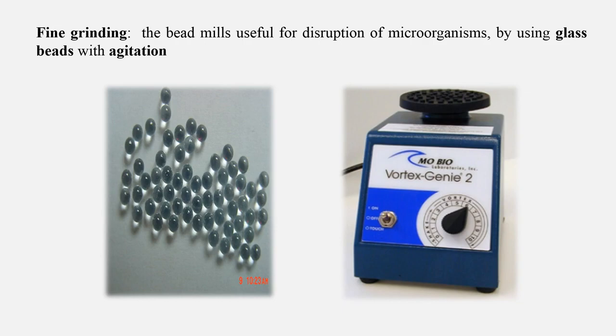هذه الطريقة تؤدي إلى إنتاج أو توليد حرارة بالإضافة إلى فقاعات الهواء، لذلك يفضل وضع العينة في محلول ثلجي أو آيس بين فترة وأخرى أثناء عملية التحطيم.